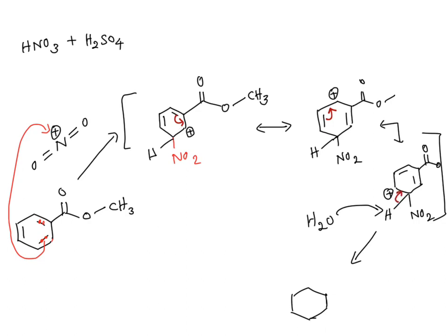And you'll get the product where nitro group is on the meta position. Okay.